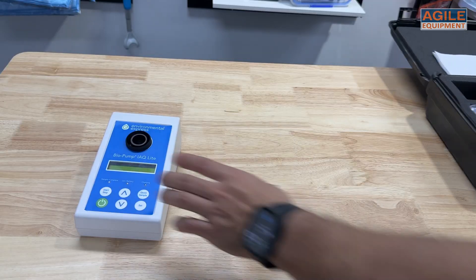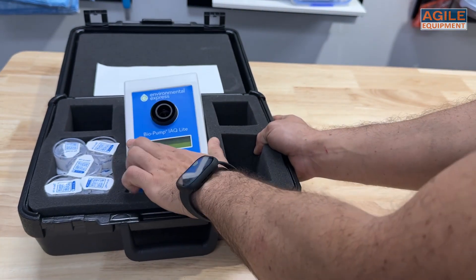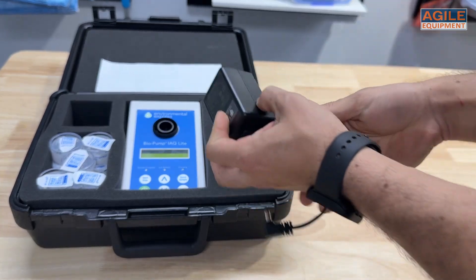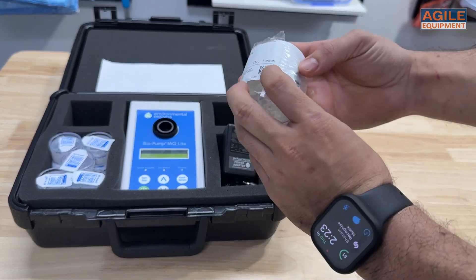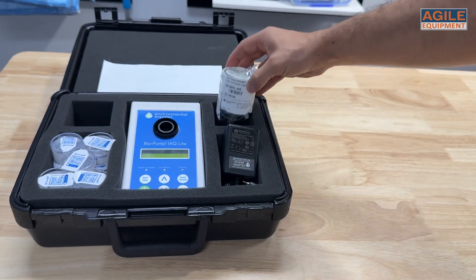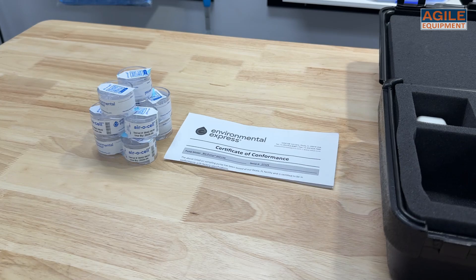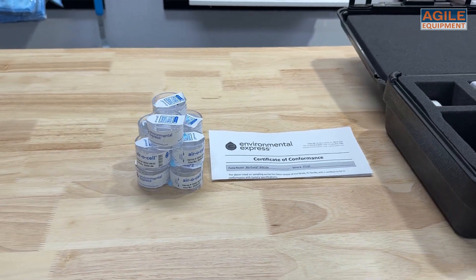When you purchase the Biopump IAQ Lite, you're not just getting the pump. You also receive a durable hard case with a custom foam insert, the charger, an Environmental Express airflow indicator, and 10 aerosol cassettes. Plus, it comes with a certificate of conformance, so you know it's been inspected and is ready for use.